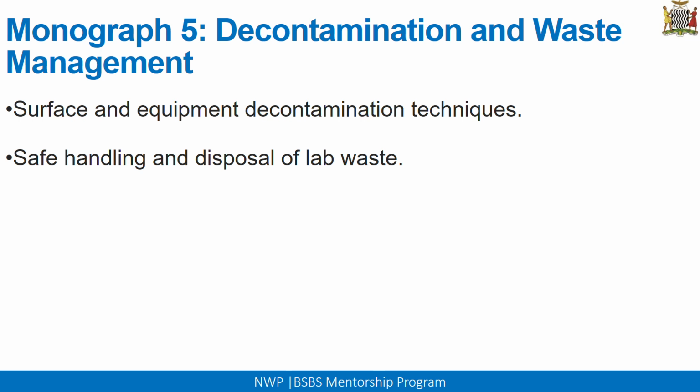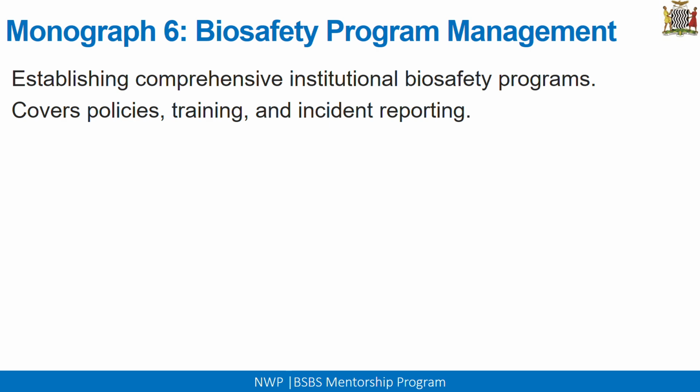Then also it gives you information on the safe handling and disposal of lab waste. How do you make sure that you have a proper waste management program? It will give you a little bit more detail on how you safely handle and dispose of all your laboratory waste. The sixth monograph is the biosafety program management.